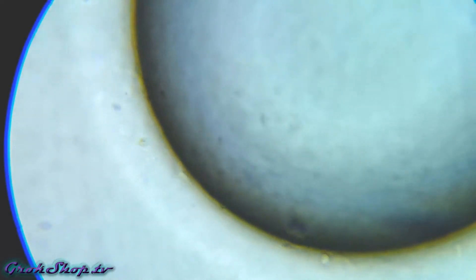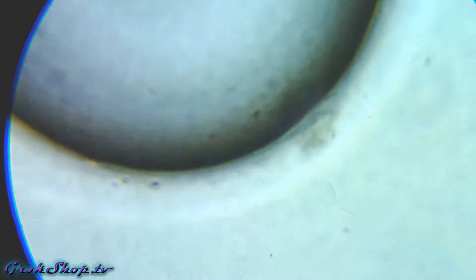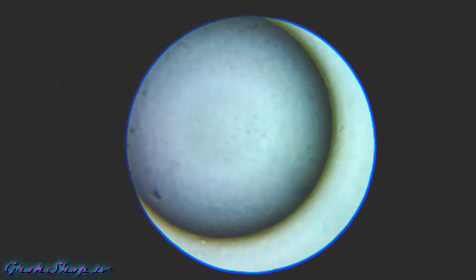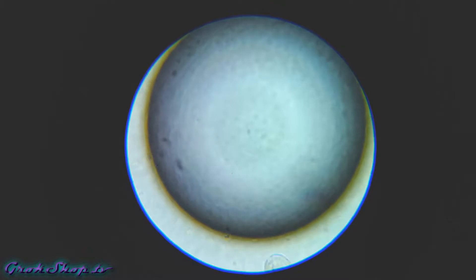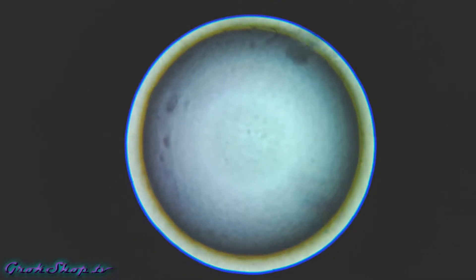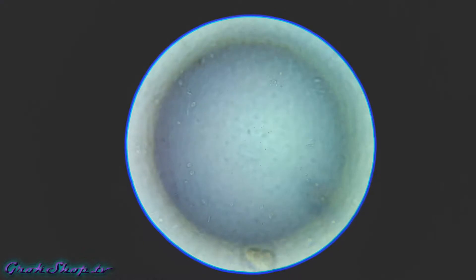We can see this is a perimeter of the air bubble that I showed earlier in the video. Typically when you see increased activity around these air bubbles, it usually means that the microbes are largely aerobic instead of anaerobic, which means they make their energy from oxygen as opposed to using some chemical reaction to get the energy they need. The organisms we want are aerobic organisms - those are the ones that typically are the most beneficial for the soil and plants.